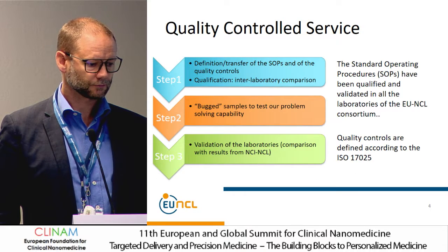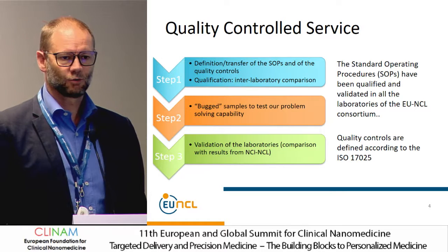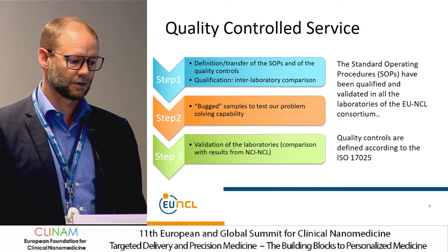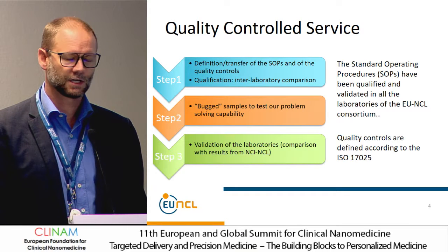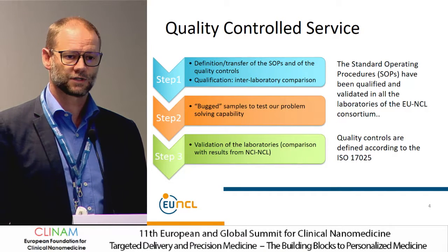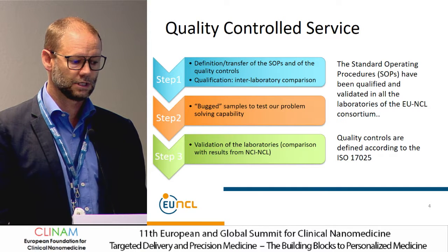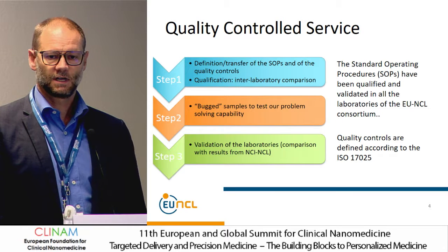Being at the quality level required to provide services for our clients has not been a long way, but a really hard way. We have organized ourselves, thankfully, thanks to our US cousins, based on the development and transfer of SOPs, adaptation of these US SOPs to the EU, as well as running several qualification and validation campaigns.